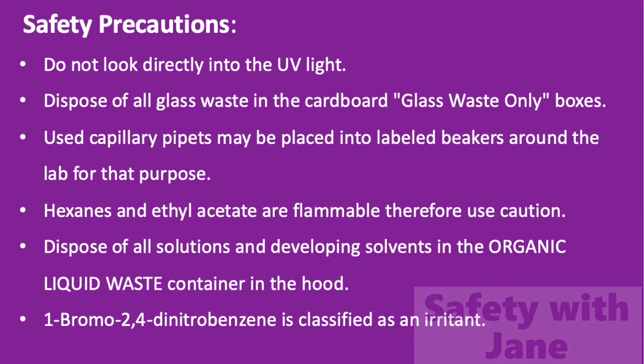Do not look directly into the UV light. Dispose of all glass waste in the cardboard glass waste only container. The capillary pipettes that are used can be placed in the labeled beakers around the lab for that purpose. Hexanes and ethyl acetate are flammable, so don't light them. All waste goes in the liquid waste container, not down the drain. 1-bromo-2,4-dinitrobenzene is classified as an irritant, so use caution with that. Now, go to the lab and be smart.